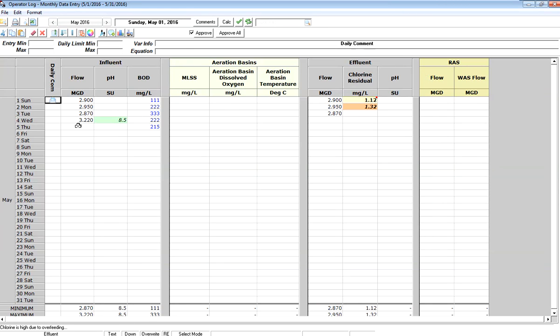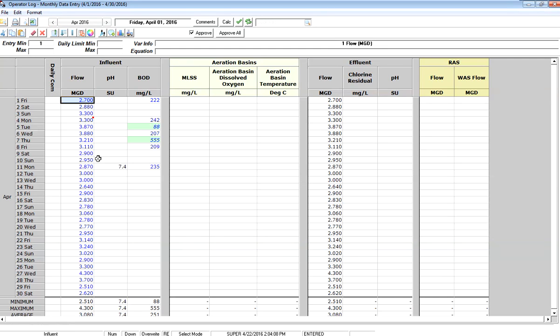The other thing that we can do in monthly data entry is use it as a data browser. So if I just want to quickly look at last month, I have this date control. Go ahead and click that, and I go back to April, and I see all the data that I've entered in April.